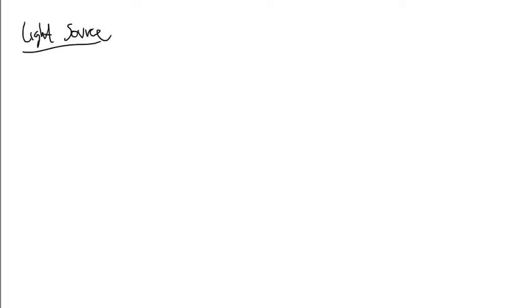All right, so here's the problem. The light source doesn't just give one wavelength. The light source can actually give multiple wavelengths. And you're probably now scratching your head saying, well, this doesn't make any sense. Well, bear with me for just a second.